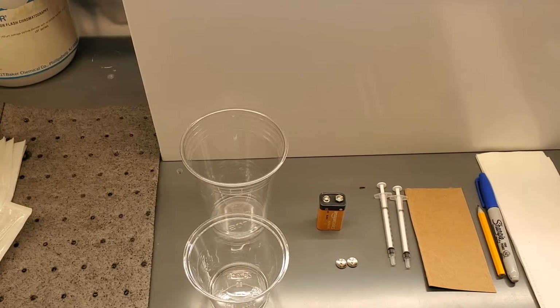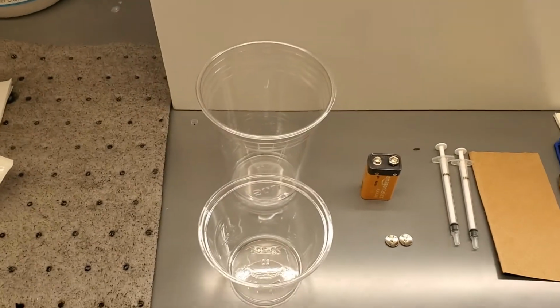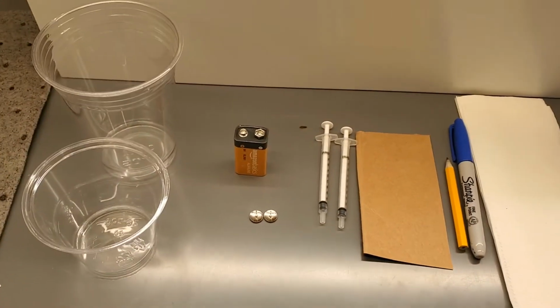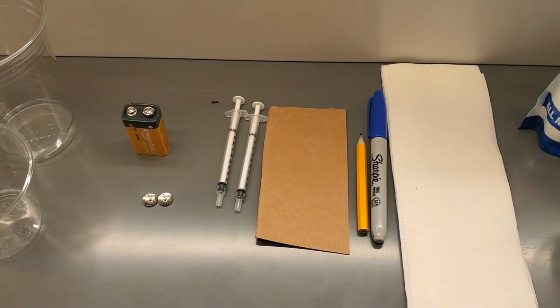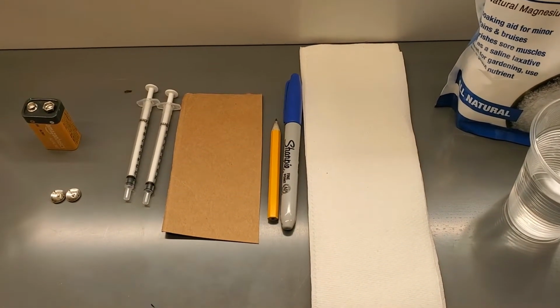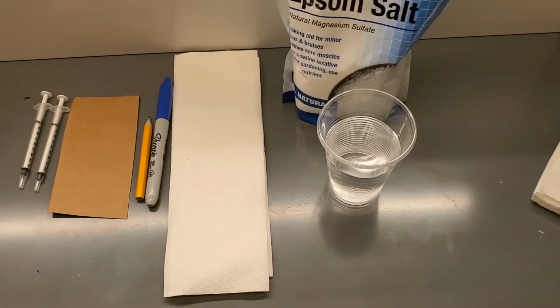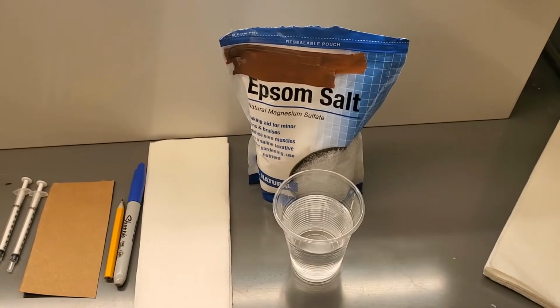Today you'll be performing an electrolysis experiment using the items that you were given in your kit. This includes 2 different sizes of plastic cup, a 9-volt battery, 2 all-metal thumbtacks, 2 syringes. You're going to need a piece of cardboard or an index card. You're going to need a sharpened pencil, a marker, some paper towels, 120 milliliters of distilled or deionized water, and some magnesium sulfate.